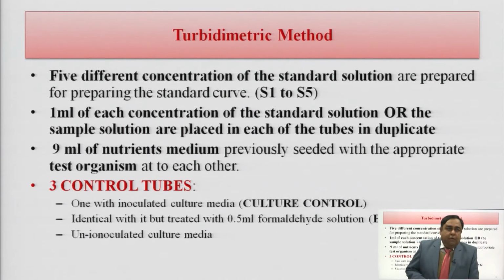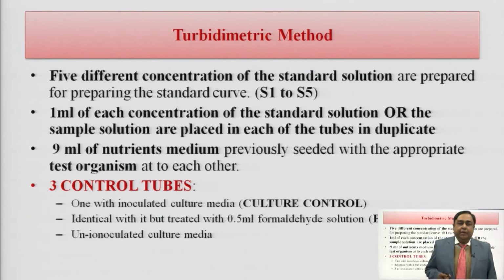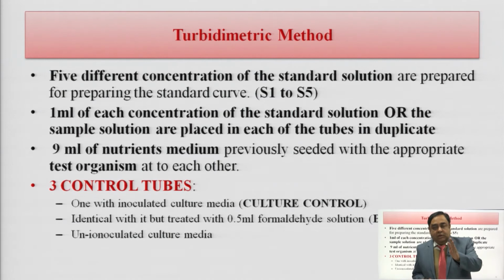Now, this turbidimetric method, what we have to do is, in the same method as we have done earlier, we have to prepare 5 different concentrations of standard solutions.